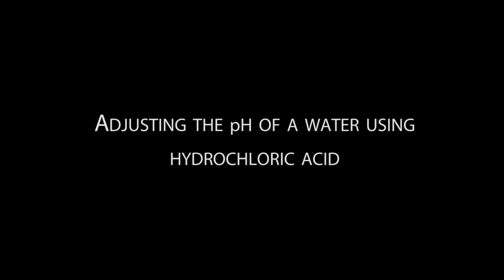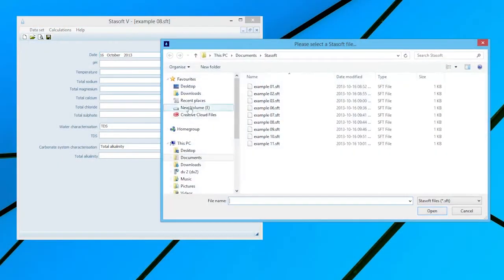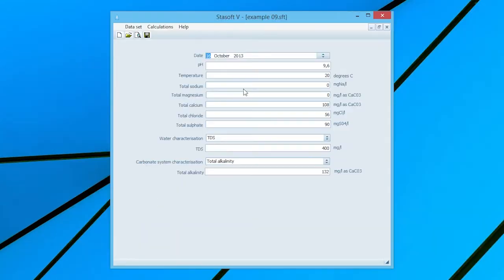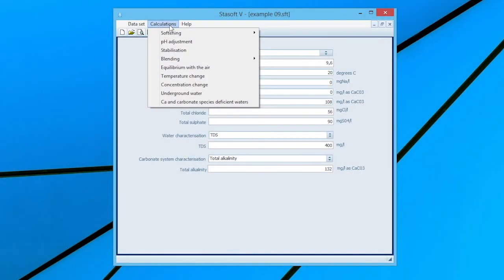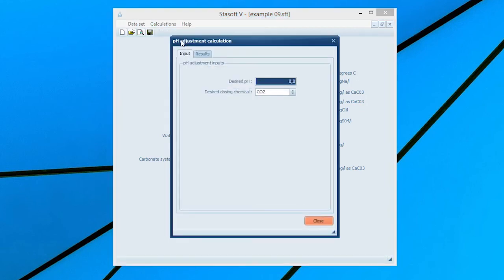Adjusting the pH of water using hydrochloric acid. Select Dataset 9 for Example 9 in the manual. After entering the data into the Dataset input window, selection of the View option will bring the window displaying the characteristics of the present water onto the screen. Close the window and select the pH Adjustment option from the Calculations menu, bringing up the pH Adjustment Inputs window.